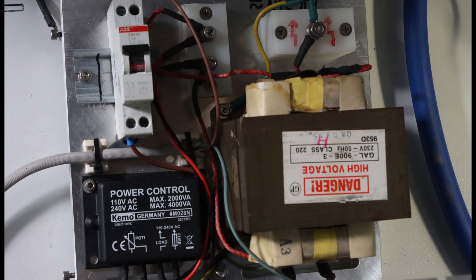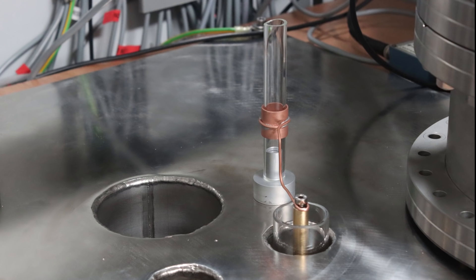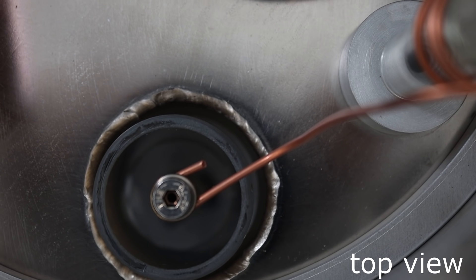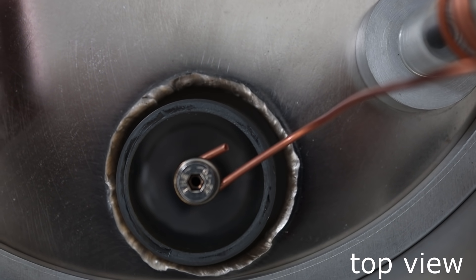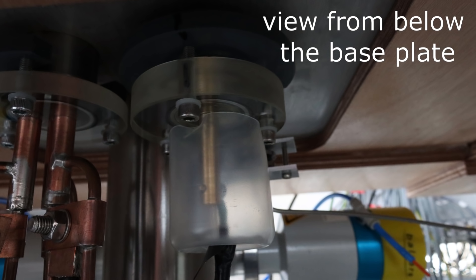The electrical source for plasma cleaning was made from a standard microwave transformer, which generates about 2kV AC. The power is regulated by inserting a simple power regulator on the line side of the transformer. I also made a special vacuum compatible feed for the high voltage of the plasma source. The feed through had to be firmly insulated from the chamber because of the relatively high powers and voltages involved.